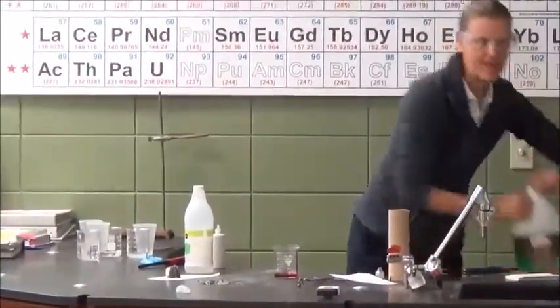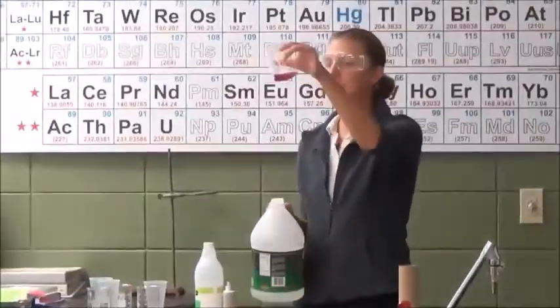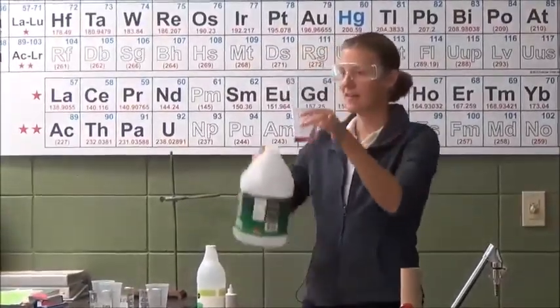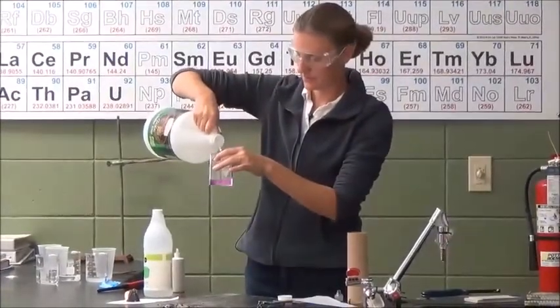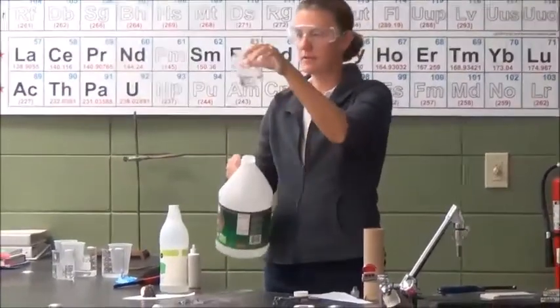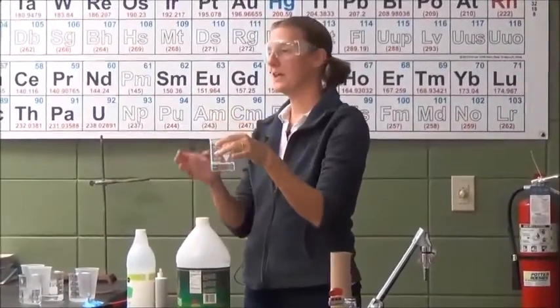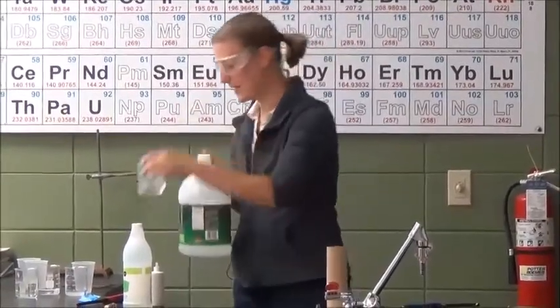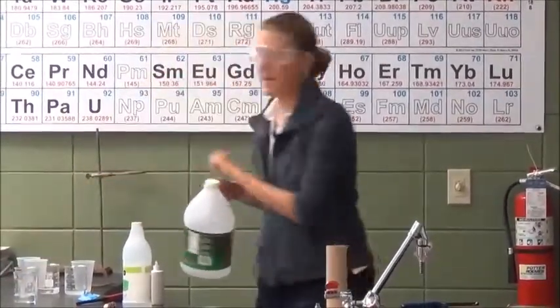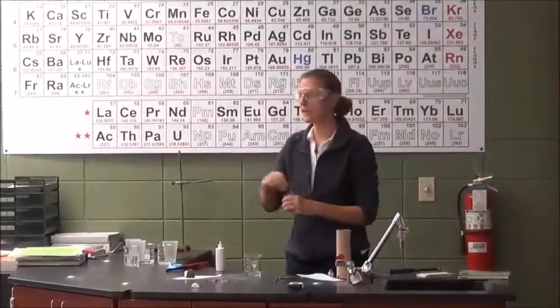Fortunately, I have some acid right here. I have some vinegar. What will happen? Clear or green? So, phenolphthalein turns pink in a base only. If I cancel that base out with an acid, the pink goes away. But that is a chemical reaction. There's a chemical change.